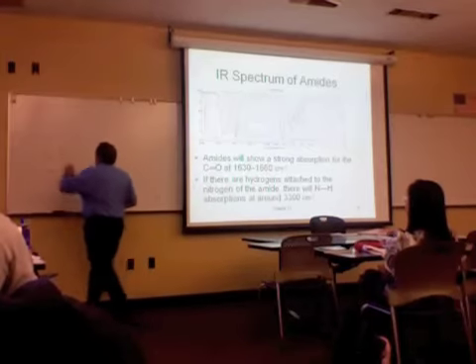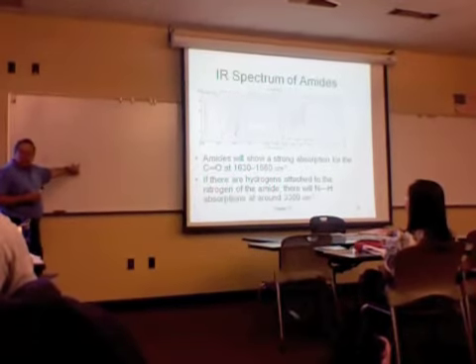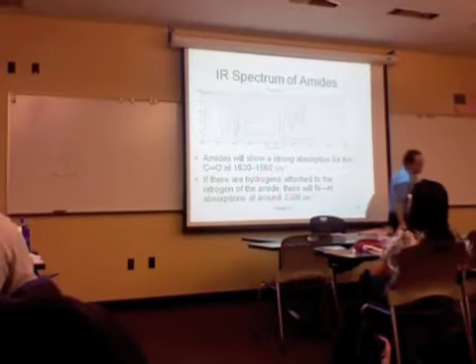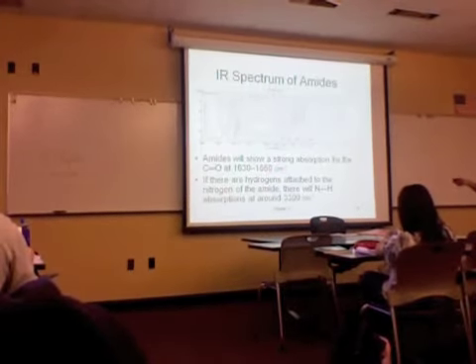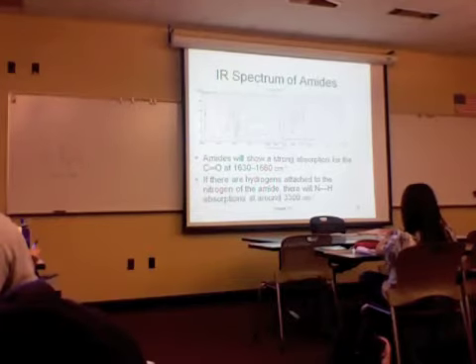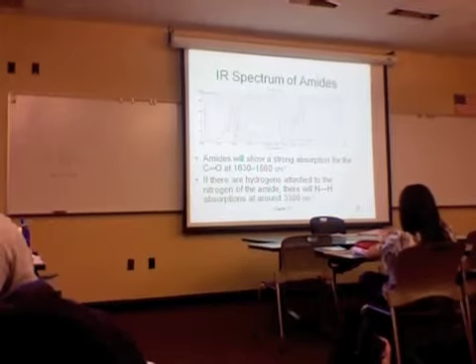Notice that this guy has the carbonyl stretch, and it's got something unique out here instead. Look what it does to the spectrum. These are usually fairly easy to see. Notice that the carbonyl band goes pretty low here. And out here I see evidence of the hydrogens on the nitrogen. So the amide structure is fairly easy to diagnose as well.